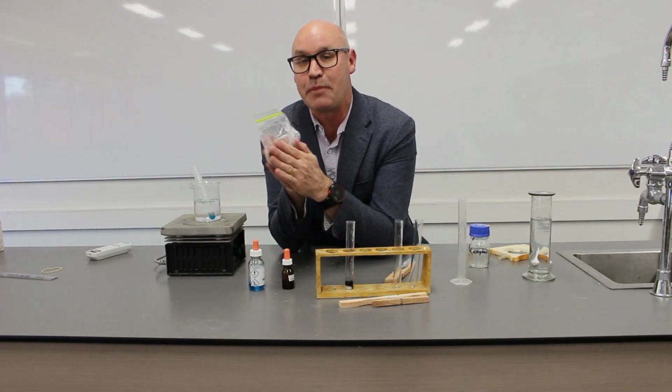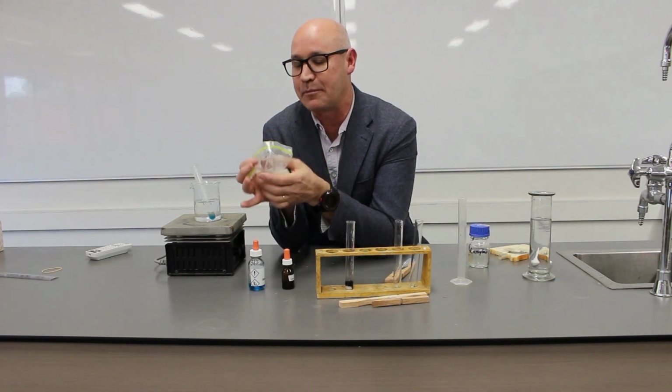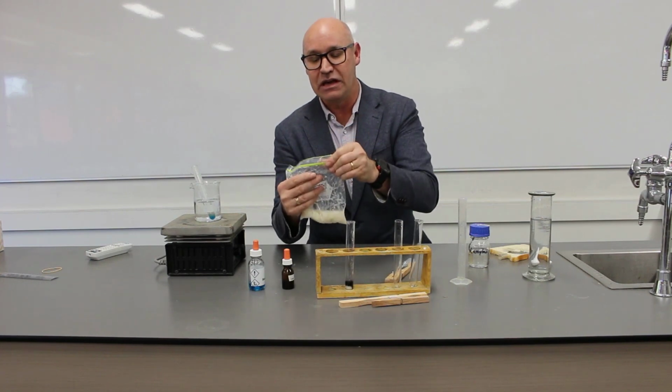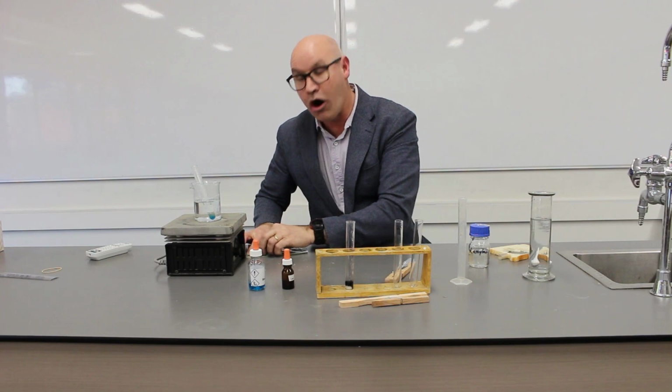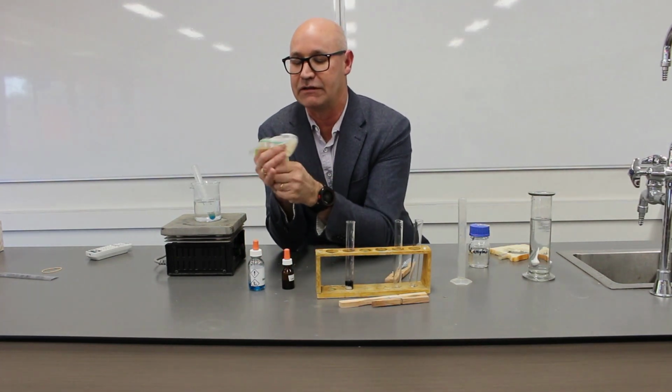Amylase is going to work best at around about 37 degrees. So we need to heat this up. We can heat it up in a couple of ways. You can heat it up in your hands as you continue to massage it, or you can put it in a hot water bath to try and heat it up to about that 37 degrees.